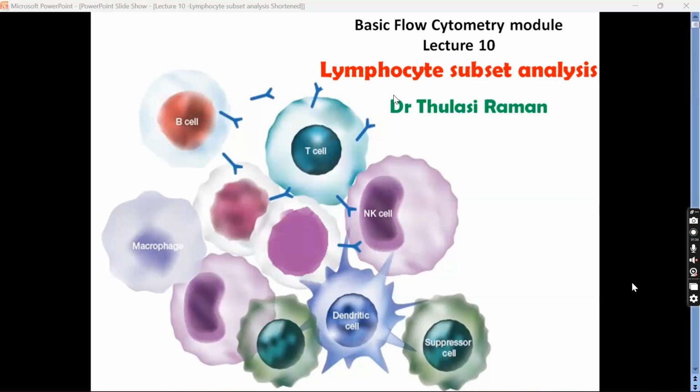This assessment will be more of analysis than questions, and then we'll have the last lecture of this particular course, which is next week, Friday, where I'll be discussing the reporting guidelines: how a flow cytometry result has to be reported, and what are the quality guidelines which have to be followed in the flow cytometry lab. That is more for accreditation and other processes, and what a flow cytometry report looks like and what it should bear. So all those things will be discussed next week. So this week, lymphocyte subset analysis. So we'll just start.